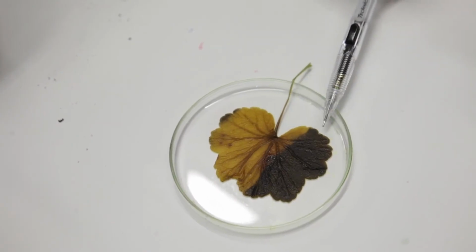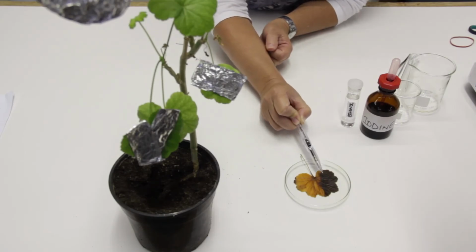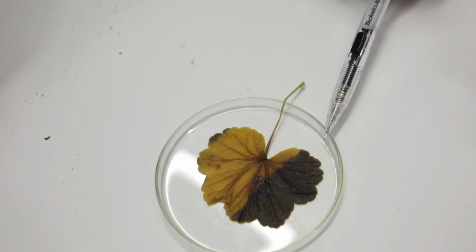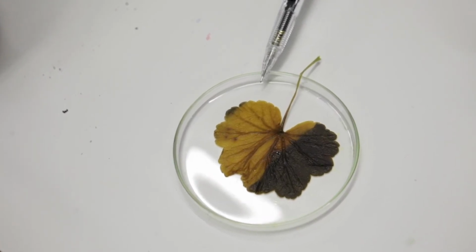Now, when doing this practical, our aim was to see whether light is necessary. So this part of the leaf that was left uncovered would be the experiment, but the part of the leaf that was covered by foil would then serve as the control of this experiment.